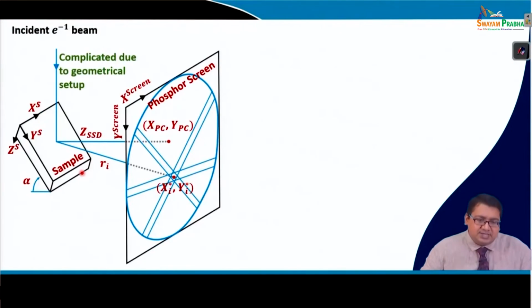So, you see, in case of EBSD, why is it important to observe EBSD rather than TEM? Because in case of TEM the sample preparation is extremely tough. In case of TEM, to raster the sample over a large area is also difficult, and texture is also related to statistics. Even if it is micro texture, a large number of grains need to be scanned to get sufficient information for the confidence of the researcher or the scientist who is working, that the information generated is quite representative.